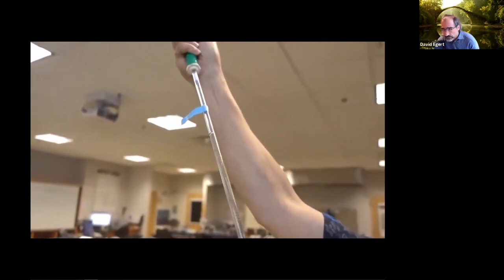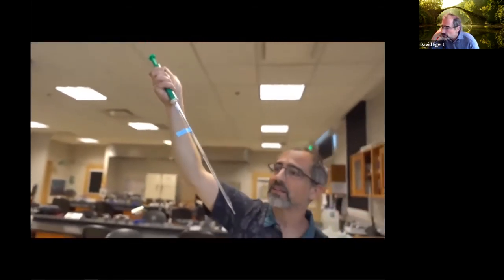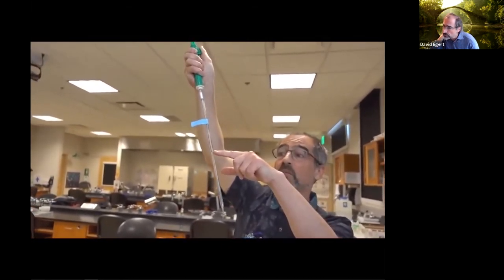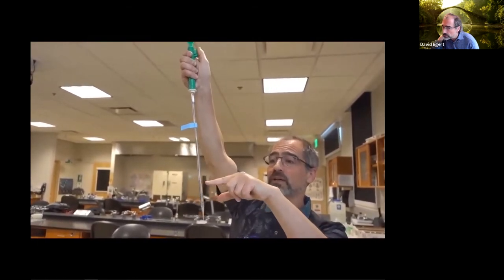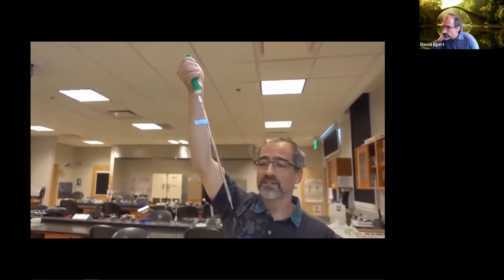And when I squirt water out, so this is just water, so this is actually safe, if I do that, this goes down to the 1. That means I have just dispensed 1 mil. I have now dispensed 2 mils, and I'm down to the 2. I've now dispensed 3 mils, I'm down to a 3. If I got it all out, I have just dispensed all 5 mils.